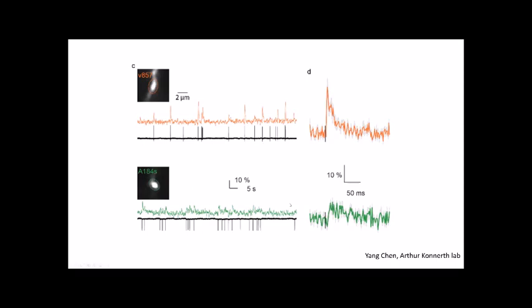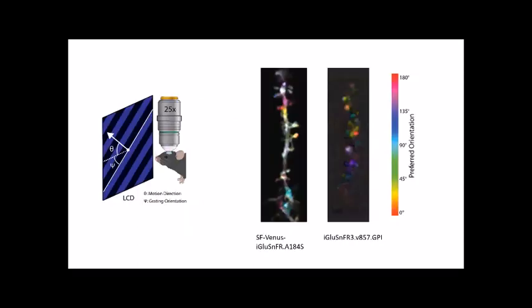And we've done a fair bit more that I actually don't have in these slides. I should say that there's a preprint of this work on bioRxiv now that goes into much more detail on this characterization and these in vivo experiments. And then we went back and did that same experiment that we originally did with this Venus iGluSnFR variant, and we saw this sort of blurry labeling of our responses at dendrites, and the patterns that we see with this new variant are much different.